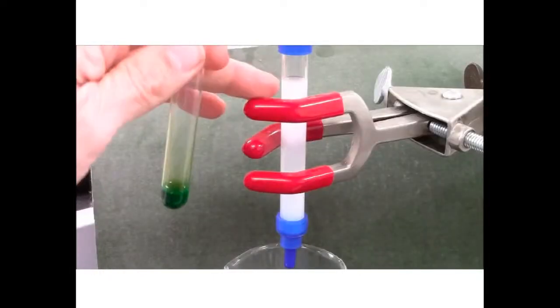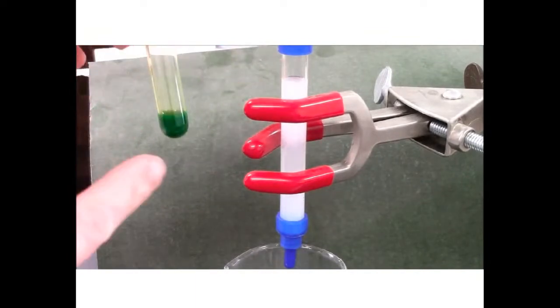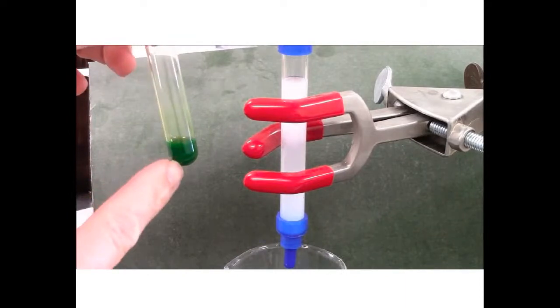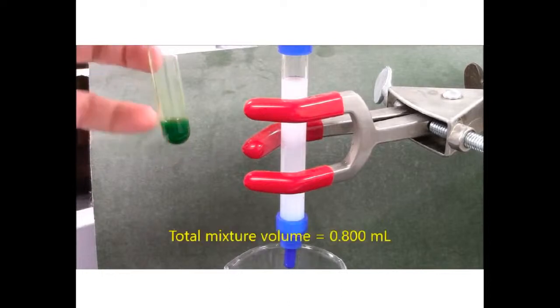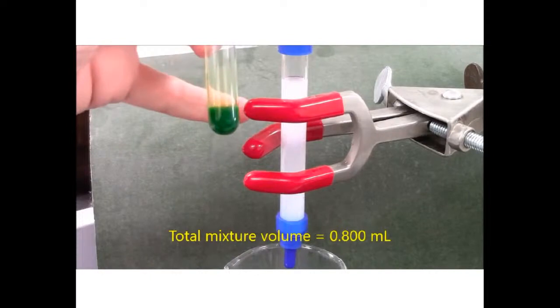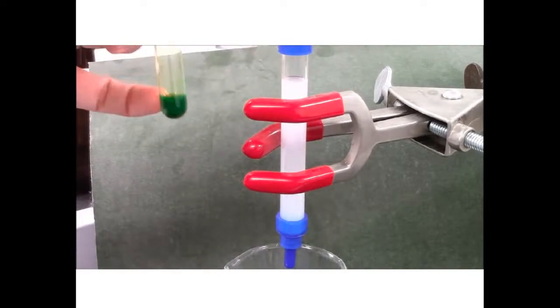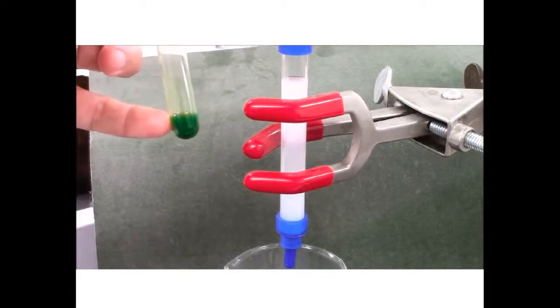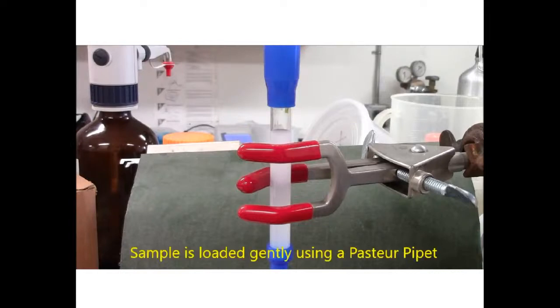I've drained the buffer, so now there's no residual buffer on top of the gel, and I've made a mixture of a total of 0.8 milliliters, 400 microliters of the fluorescein, 400 microliters of the blue dextran. Nice green color. I'll separate these on my gel. For this size column, this is getting near the maximum I would put on the column. I'm using a Pasteur pipette to gently load my material onto the column without disturbing the gel bed.